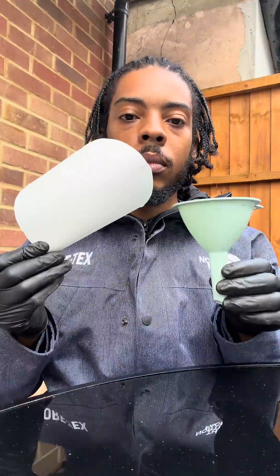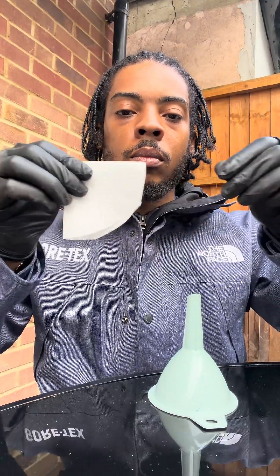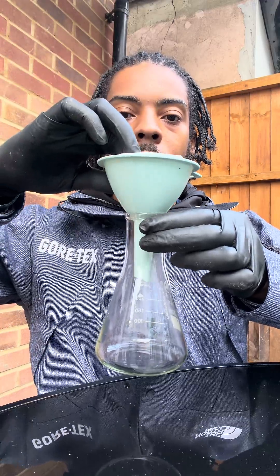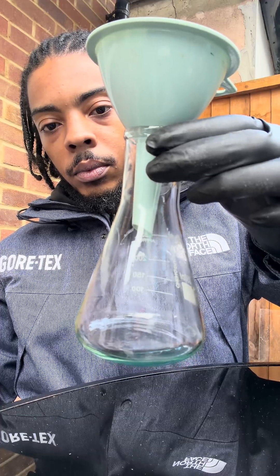Then after that, I need a little filter paper and a funnel, innit? Then I'm going to fold up the filter paper nice in that, so we can just put it into the funnel. So obviously, we're going to slap that into a conical flask. Then we're going to pour the mixture through the filter paper so that we can remove the excess copper oxide in that, fam.